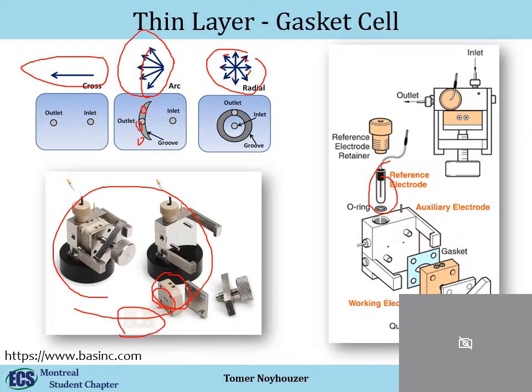They give you flexibility in the pattern, and if you have one of those in the lab, then it's great. You can have great results with it. They're not that expensive, and if you have a machine shop in your institution or the place you work, you can design different types of electrodes and gaskets depending on your needs.